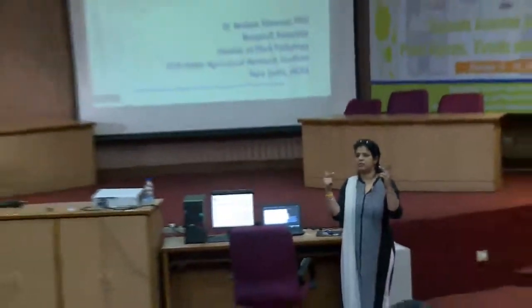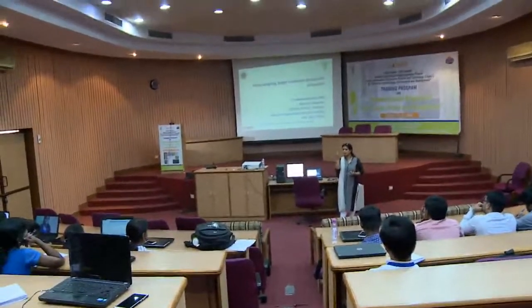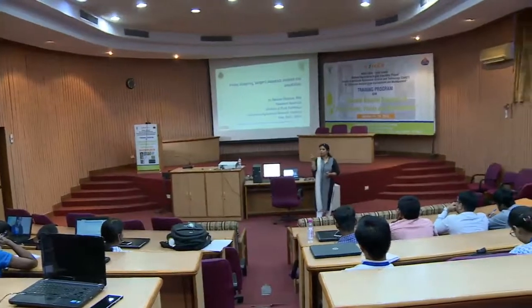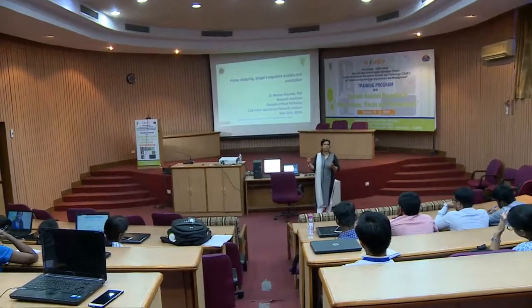So now you select the sequence, whatever it may be, let us suppose it is a 1 kb region, and you want to amplify a region of somewhere around 800 bases, correct.